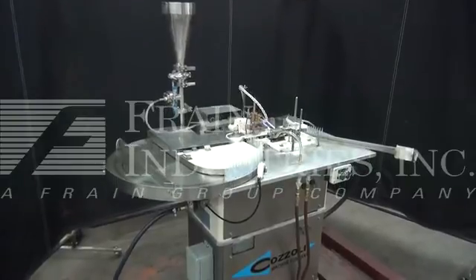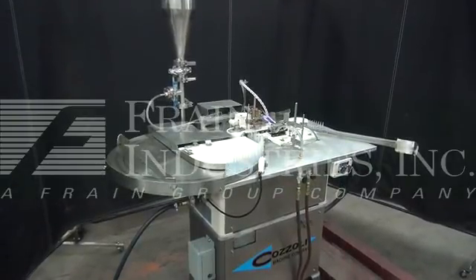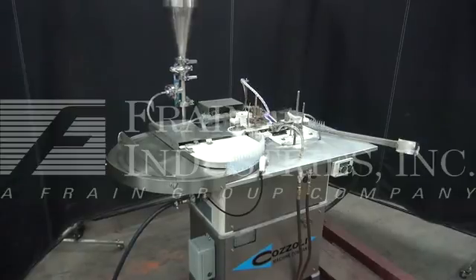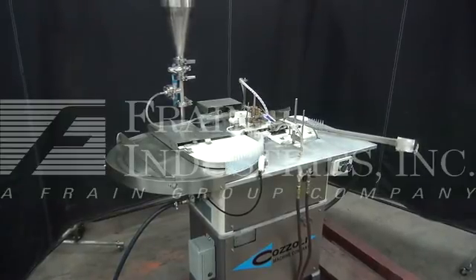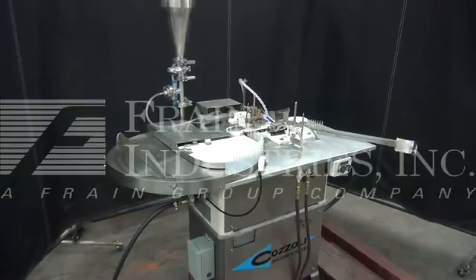The voltage on the Cazoli is currently set for single phase, 60 cycle, 120 volts. We recommend a field service technician to assist with your start-up and training on the machine. Please contact our field service manager to meet all your field service requirements.